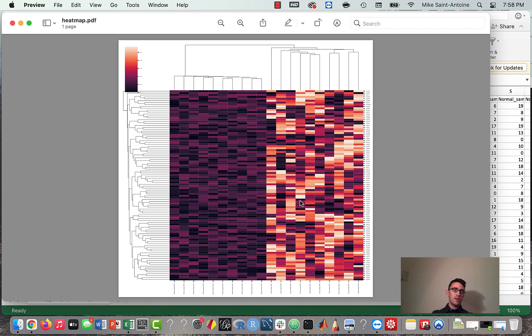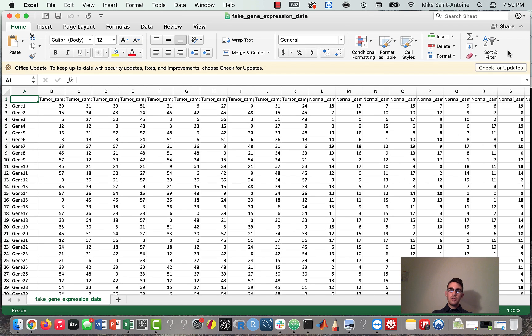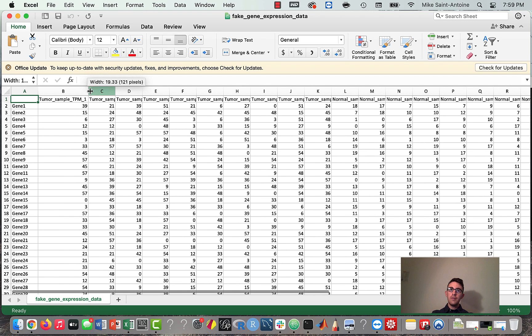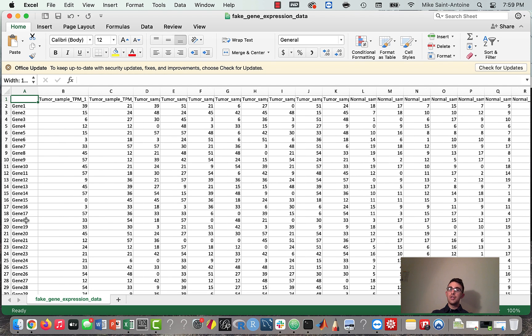In this lesson I'm going to show you how to make this plot in Python. Before we get to the coding, let's look at what the data looks like. This is a CSV file that I made — I opened it in Excel just to make it easier to look at, but it is actually a CSV file. The raw file has each cell separated by a comma, with a column for each sample and a row for each gene.